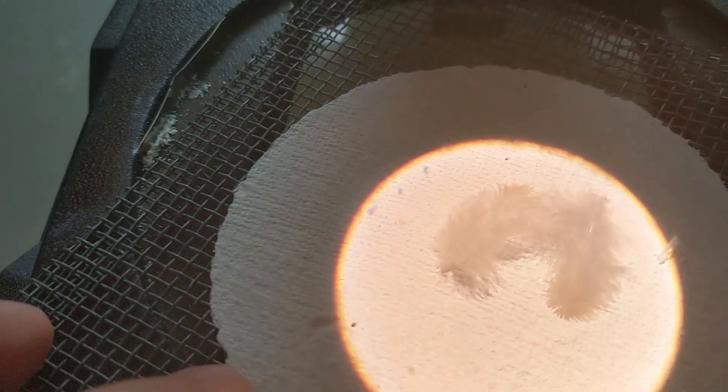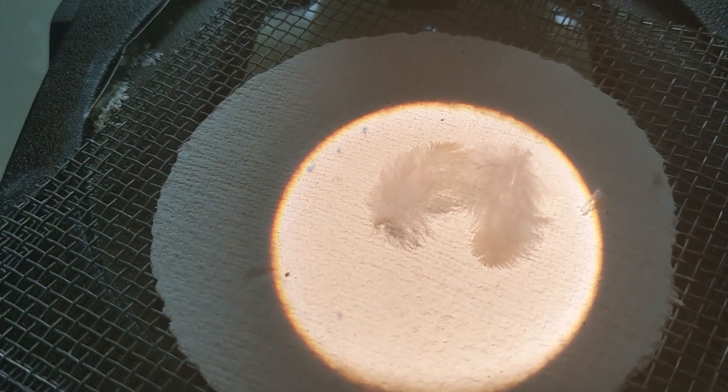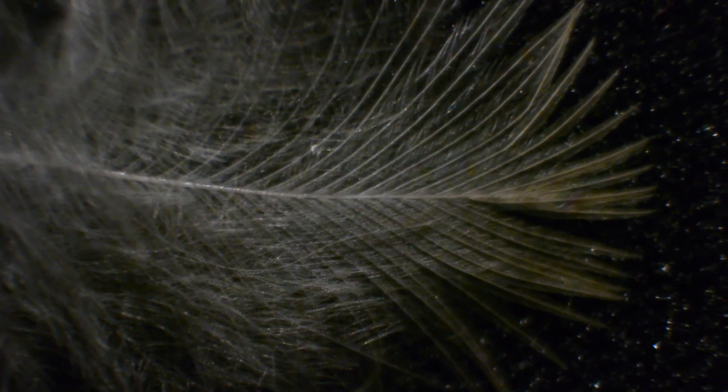Now if we look at a down feather under a microscope, what you'll notice is there's a rachis, and there are barbs, and there are barbules, but they don't really connect. They stay loose and unconnected, kind of like a tangled bush. Now this kind of arrangement is really good for holding pockets of air, and holds it close to the bird's body. Birds are warm-blooded. When the heat comes out of their body, these down feathers help hold it there close to the bird.